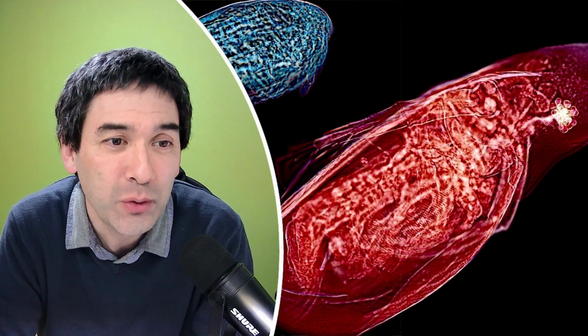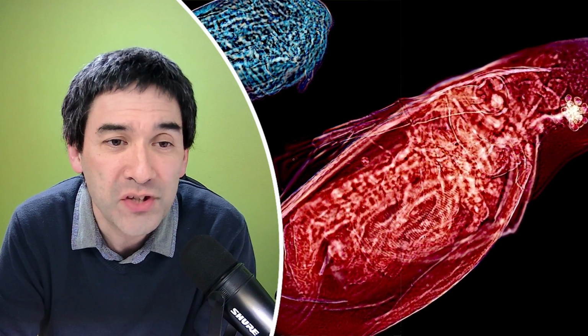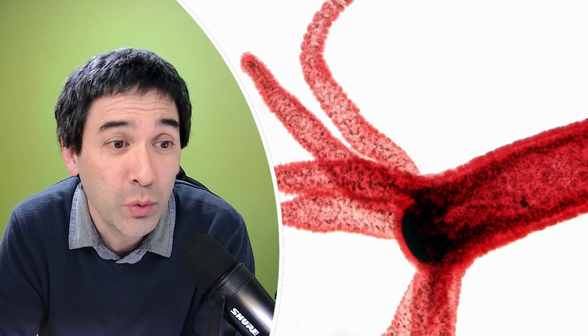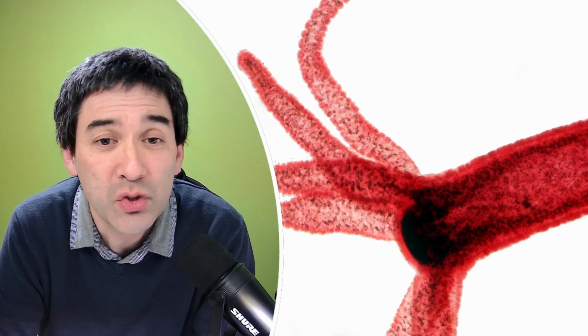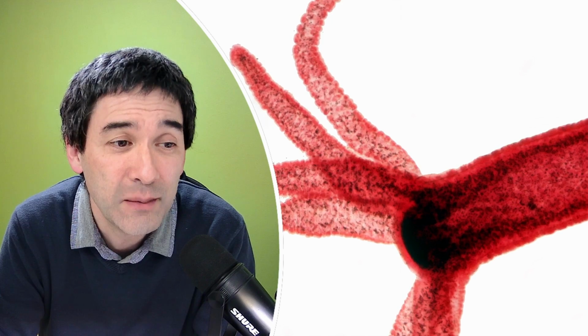Next question: how do you clean and reuse your cover glasses without cutting your fingers? I throw them out because I always end up cutting myself while trying to clean them. A third question: what are those other tiny organisms swimming around it? And this is in reference to one of my videos that I made.